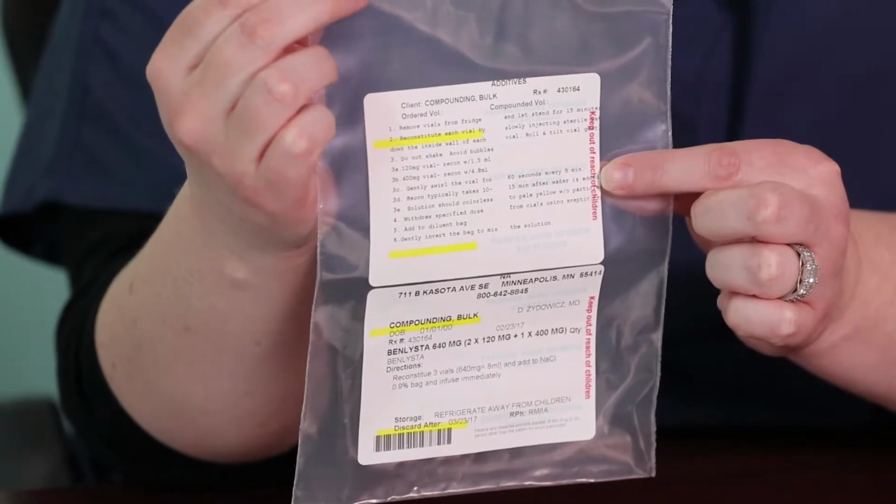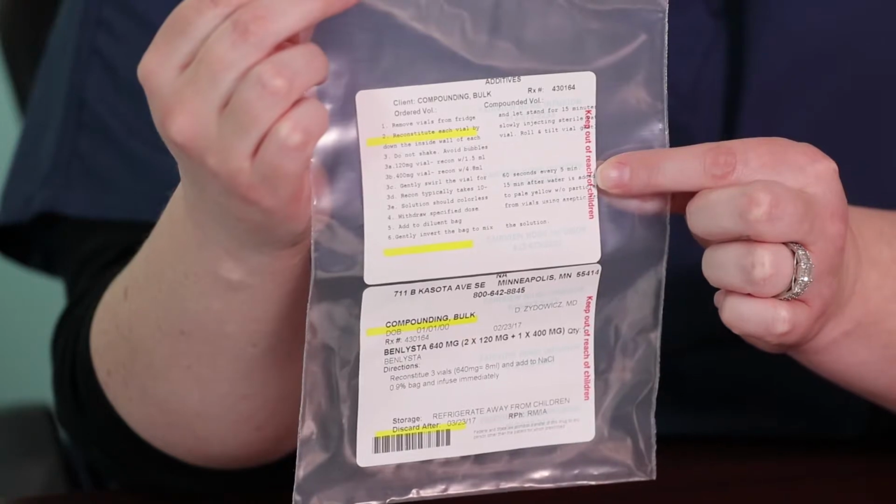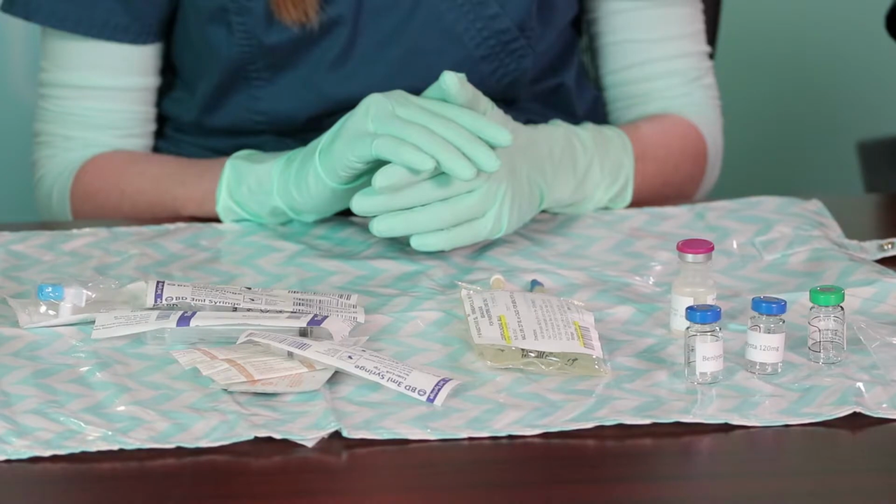On the label, you will find specific medication instructions for mixing the drug you are working on. If any volume needs to be removed from the final bag of base solution, that volume will have been removed in the FHI clean room. We will only need to add final drug to the bag.